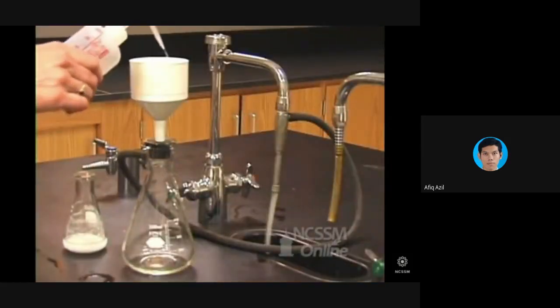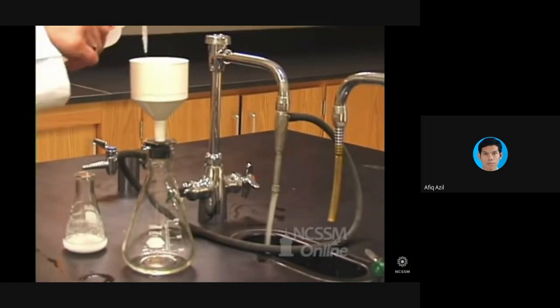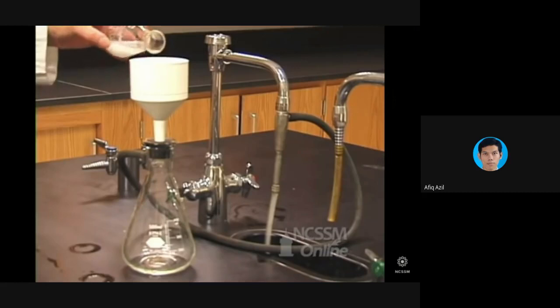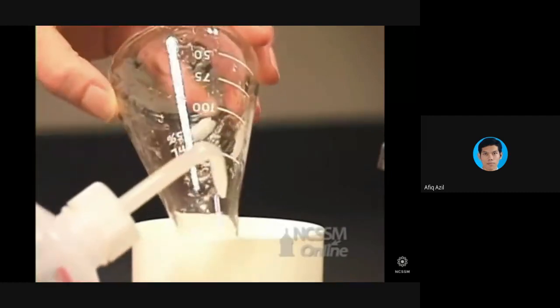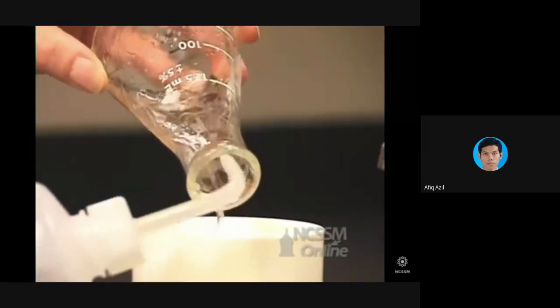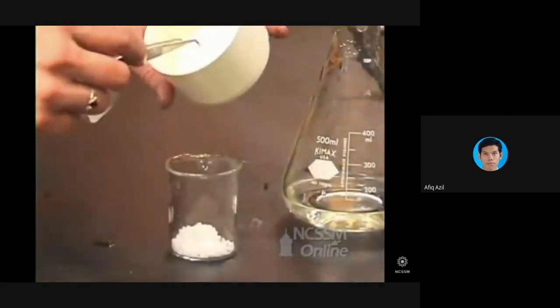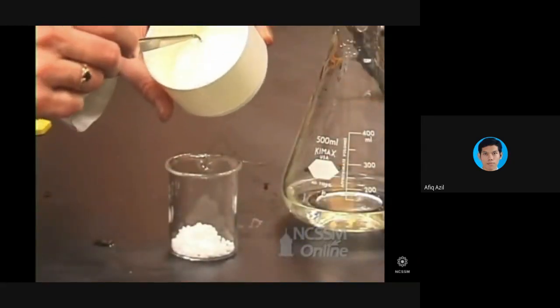We'll use just a little bit of water to make a nice tight seal, and then we'll pour our aspirin solution into the funnel. We're going to rinse the sides down. We want to make sure we get all of the aspirin into our funnel. You can see here we have lots of aspirin.